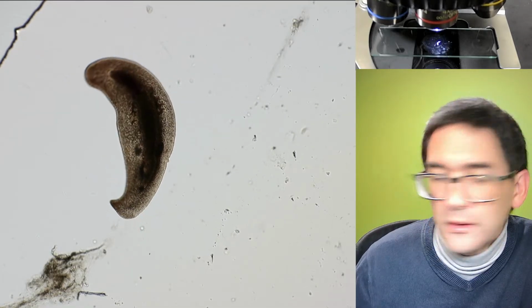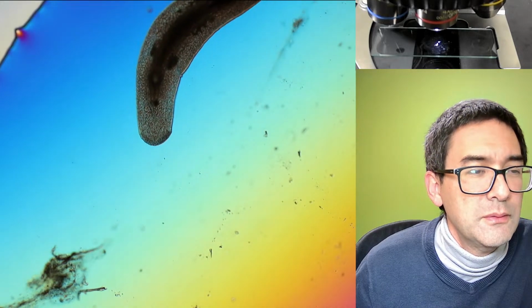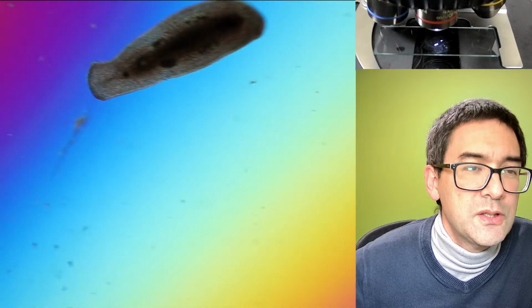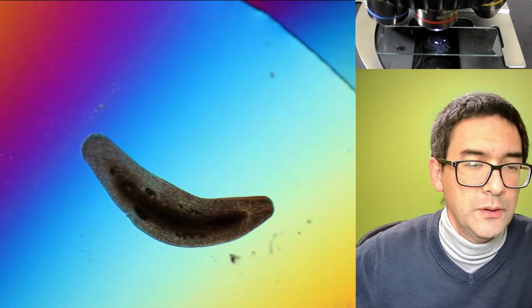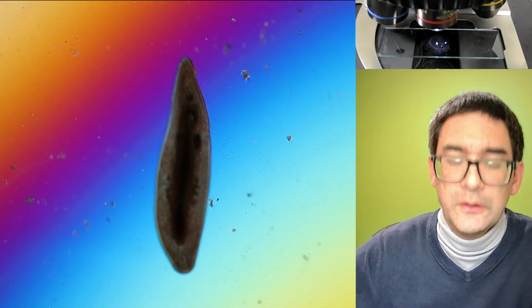If you want to have some color, then I can add this one over here, this little prism. Let's give it some color. So it looks also nice. And you see the flatworm is fairly large, and therefore it always goes a little bit out of the field of view. So let's see what happens.